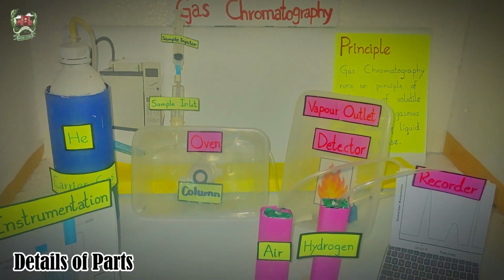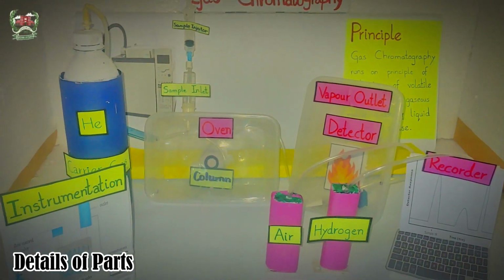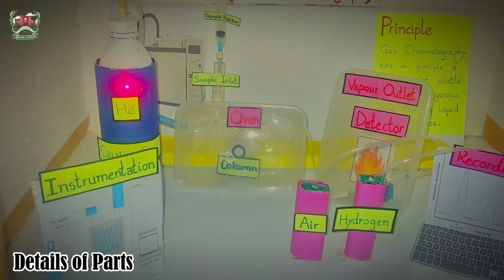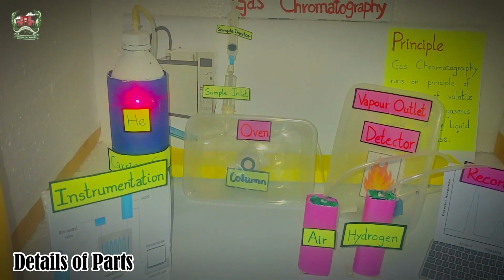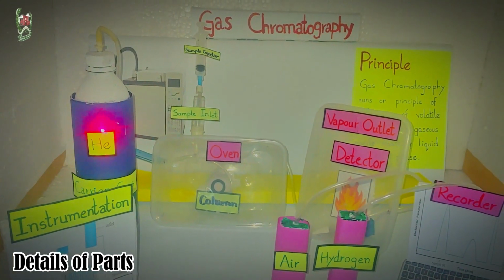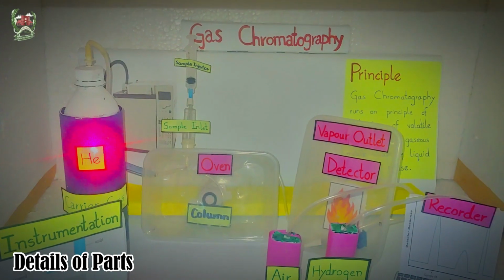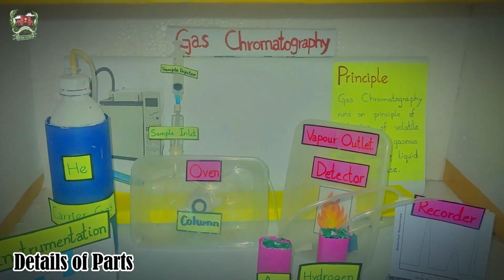Now coming to the detail of various parts of the gas chromatography instrument. So first part is the gas tank, which is made from stainless steel and contains gas, and gas can be used as a mobile phase, which may be helium, nitrogen, hydrogen, carbon dioxide and air. Among all these gases, helium is commonly used as a mobile phase in gas chromatography.